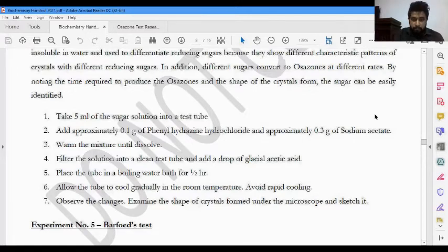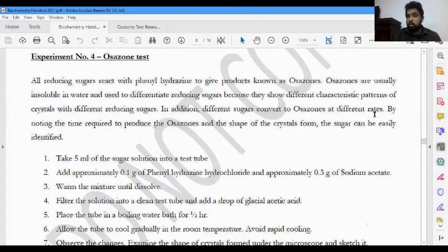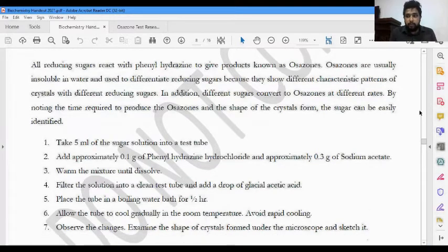Usually in biochemistry practicals, we will provide you a supersaturated solution, and you have to do all these experiments. If you do not have it in a class examination, a practical examination, you are lucky. But usually you have to do all these steps. This is a very key part of biochemistry practicals.